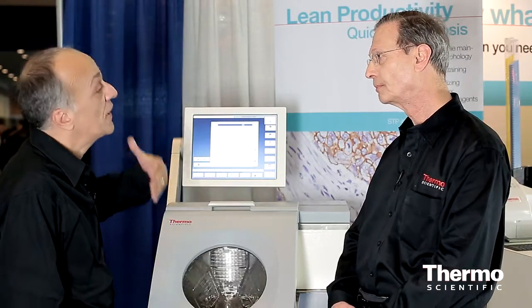Meet Peter Kilner. He's an expert in anatomical pathology. What's the takeaway for the busy lab manager, the lab director, who's looking at how do I keep up with samples, how do I keep up with volume?